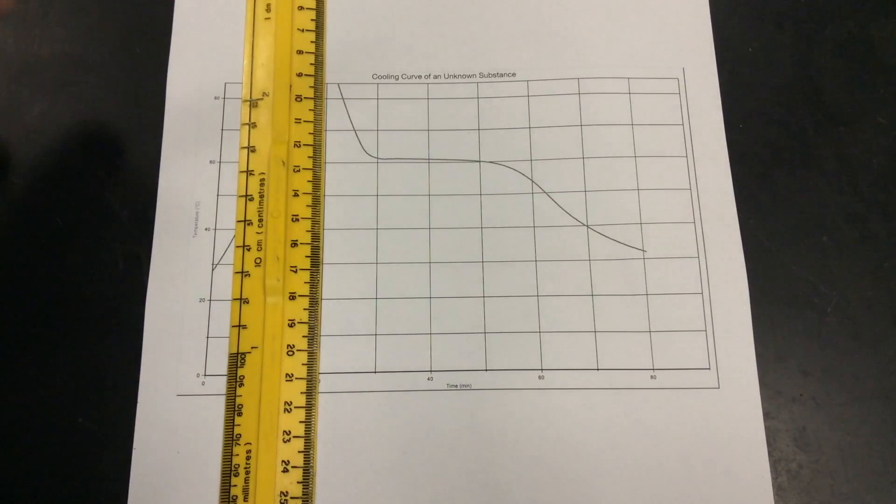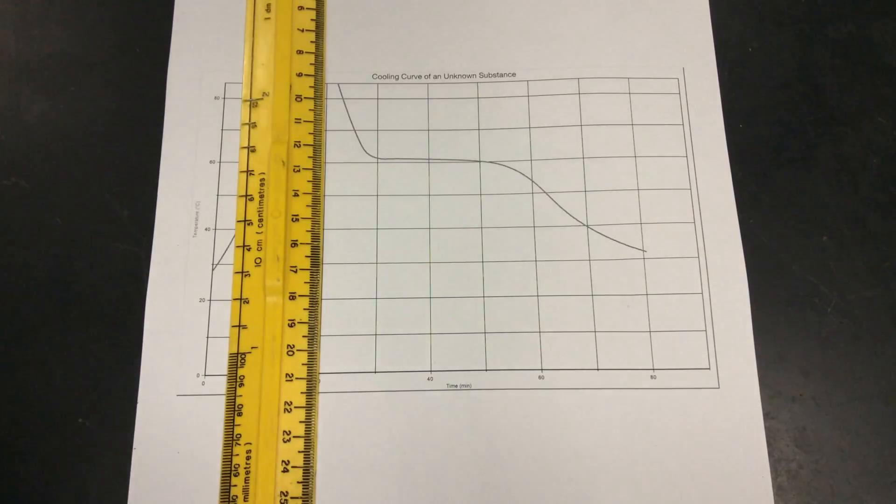The cooling part, because we pulled it out of the heat and cooling was going from hot to cold, remember our second law of thermodynamics, energy is being dispersed outward. This is a better way to measure the actual melting point. We do this in industry. We do this in a chemical lab. We figure out our compositions by looking at melting points. We actually melt it and then we watch the temperature at which it freezes.